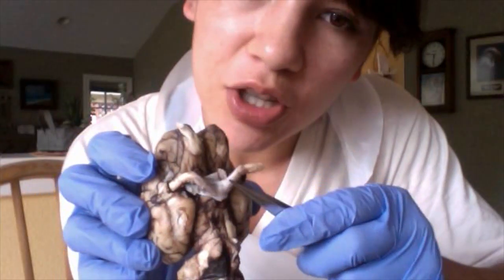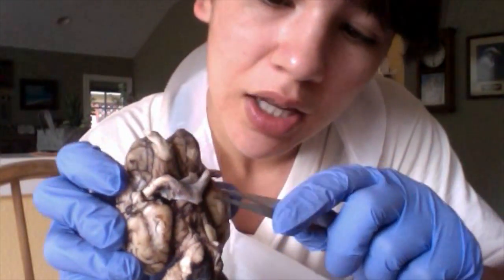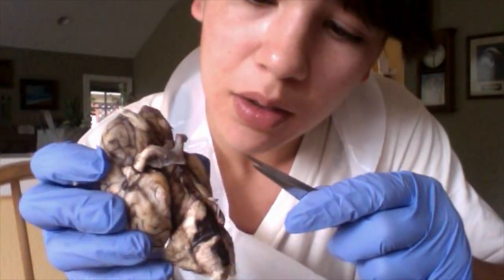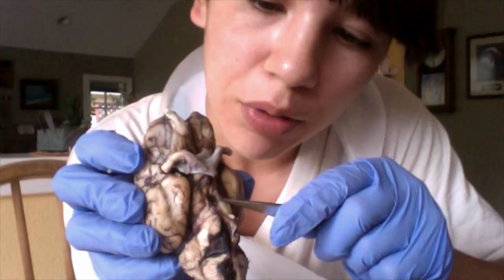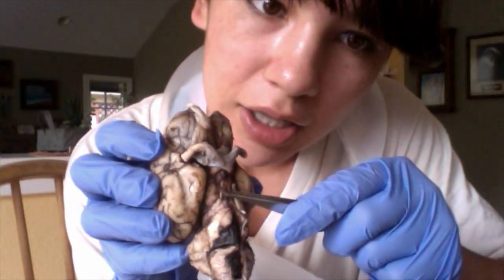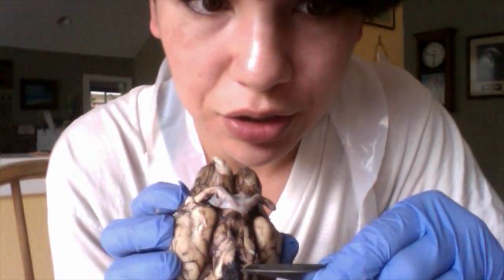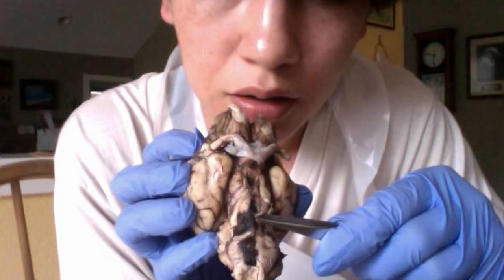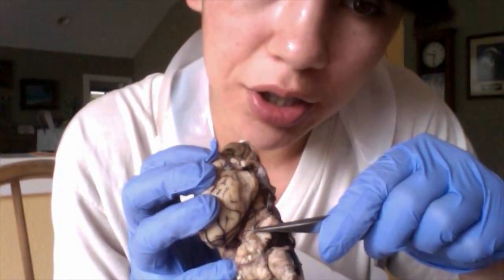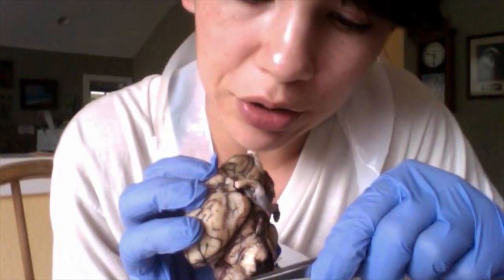Now we're going to look at the cranial nerves on the sheep's brain. As I previously mentioned, we have the olfactory bulbs here, which run down the olfactory tract. I have the optic nerves, which then decussate at the optic chiasma. Now if we go toward the center of the brain, I have the oculomotor nerve here and here. Going further down, I have the abducens nerve here. And on this side, I was able to locate the trochlear nerve here, and then down here, I have the trigeminal nerve.